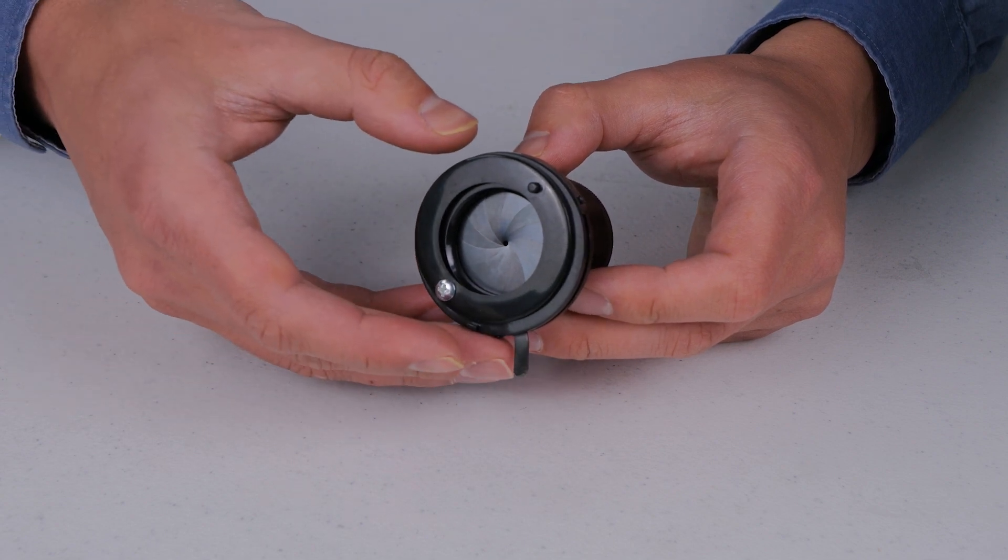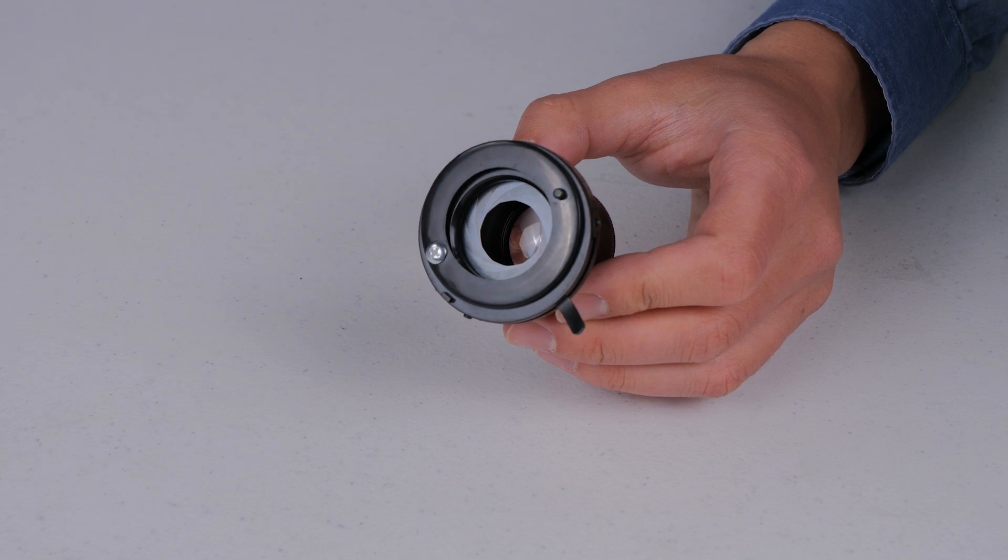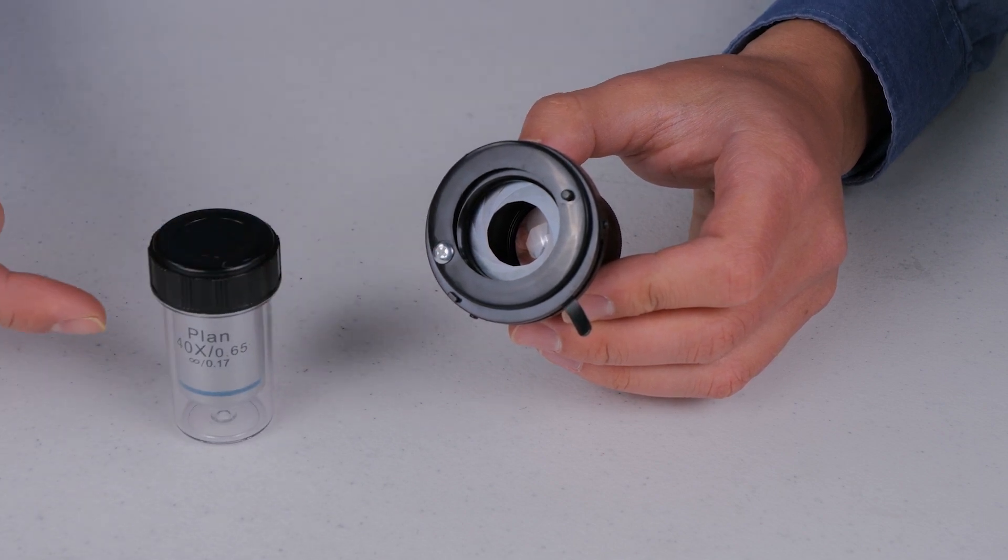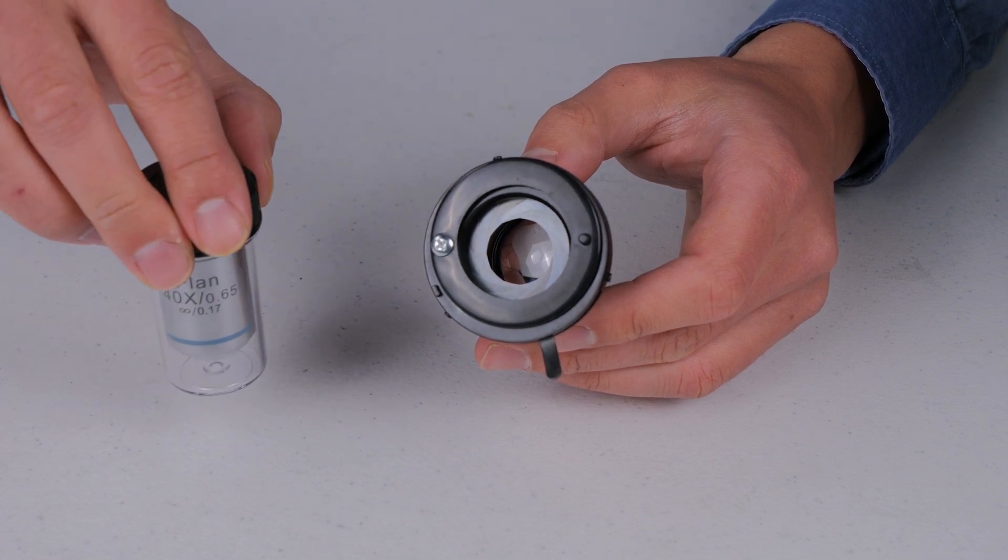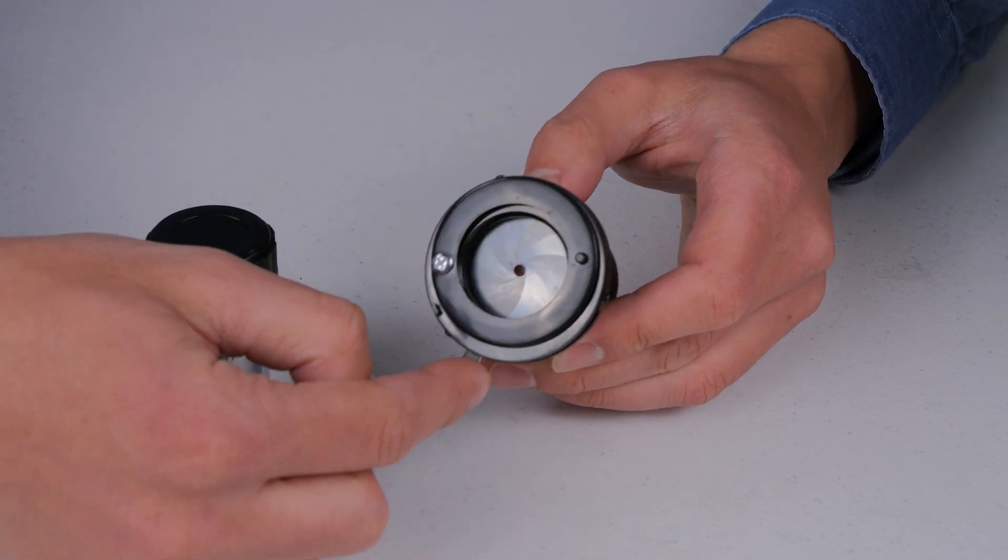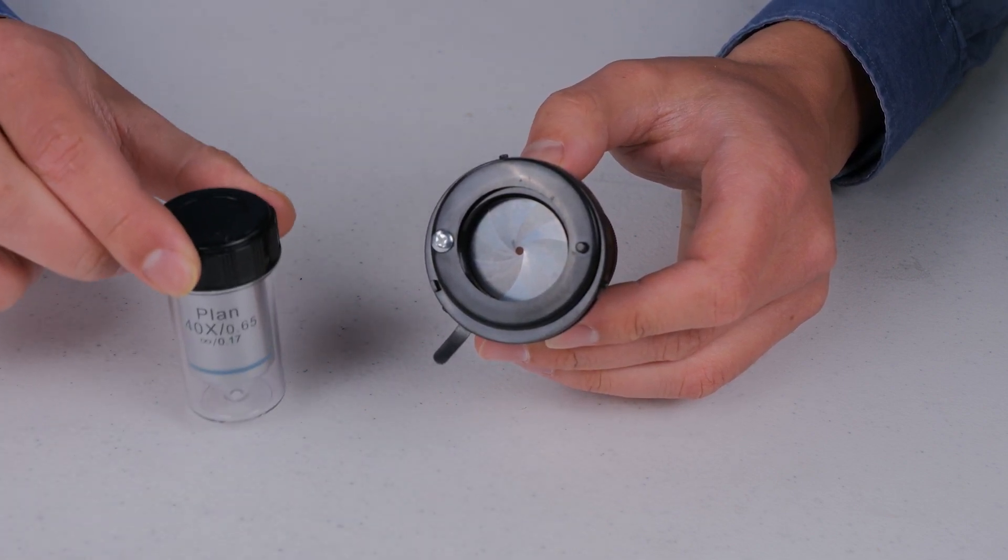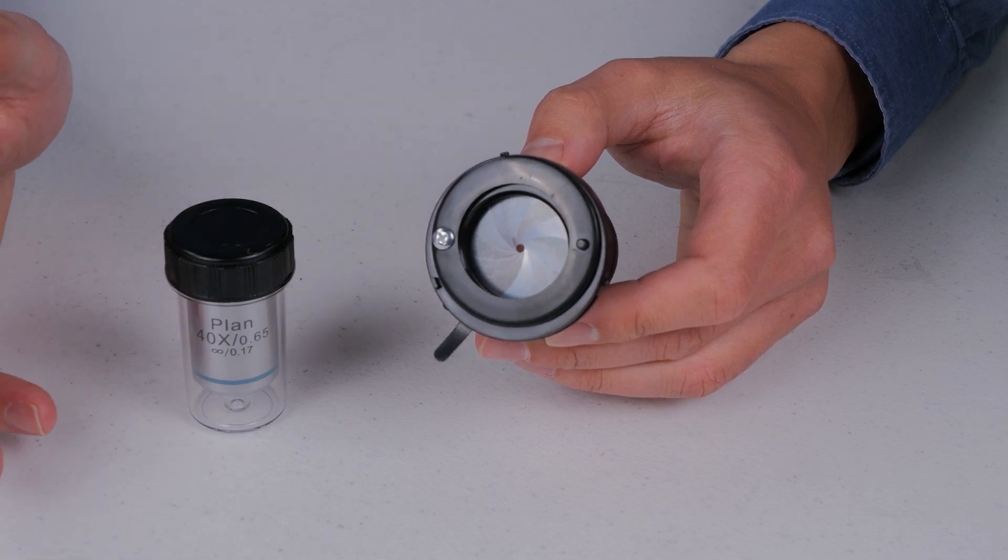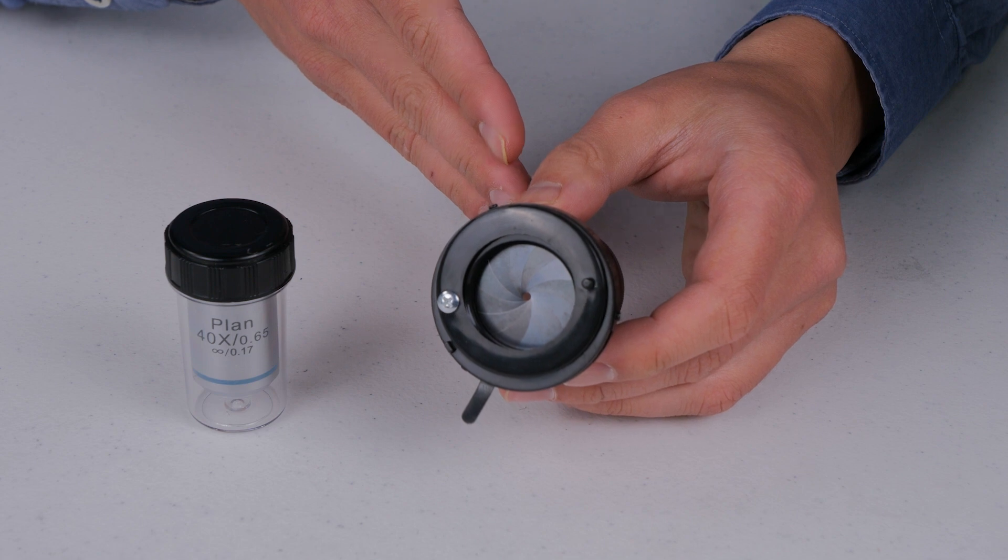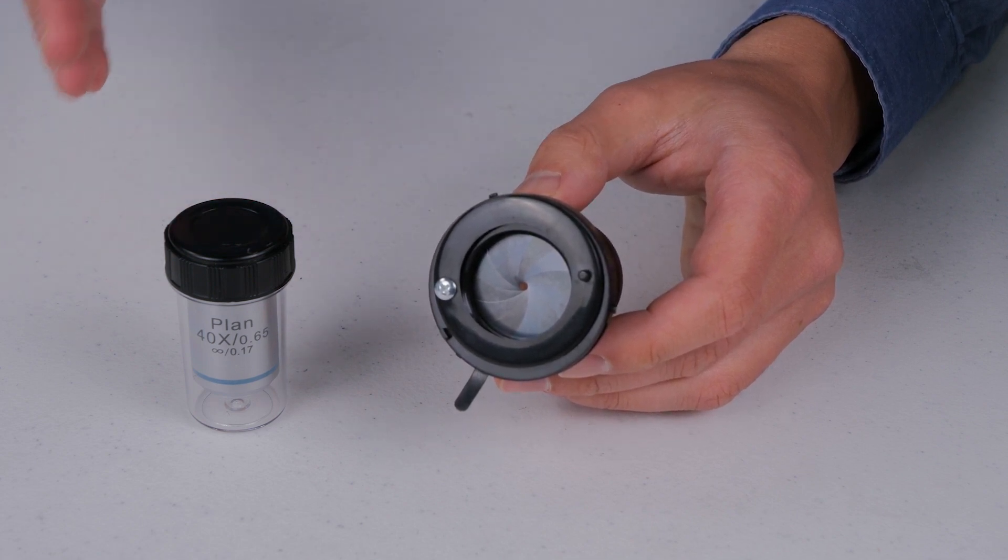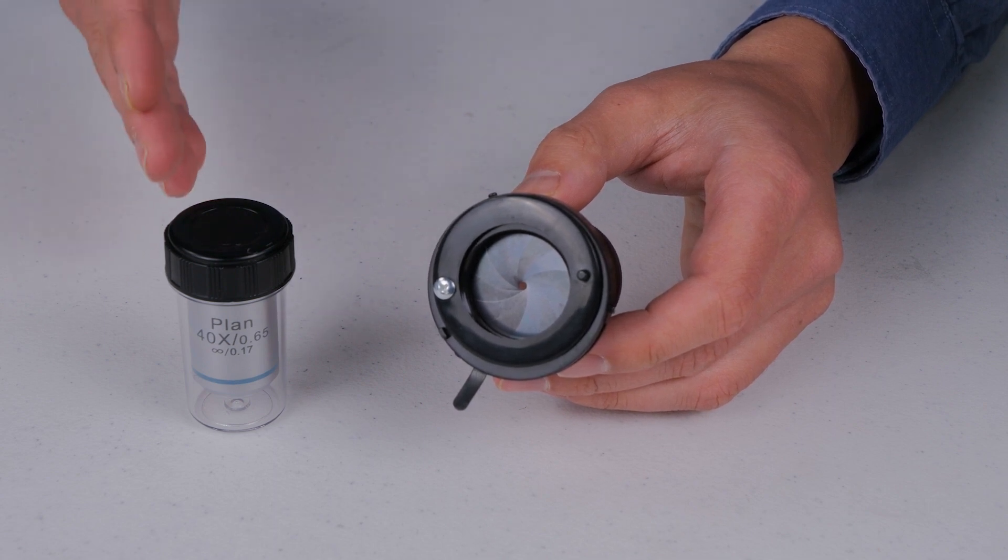And the reason why you can adjust bright field condensers is because you typically want to match the numerical aperture of the condenser to the objective. If you were to, this is a pretty relatively high numerical aperture objective, if you were to illuminate it like that, you would actually be not achieving the full resolution that this objective can get because the numerical aperture of the system is both the angle of the light that's illuminating the sample, but then also the angle of the light that's entering into the objective, which is collecting that image and then later presenting it to your eyes.